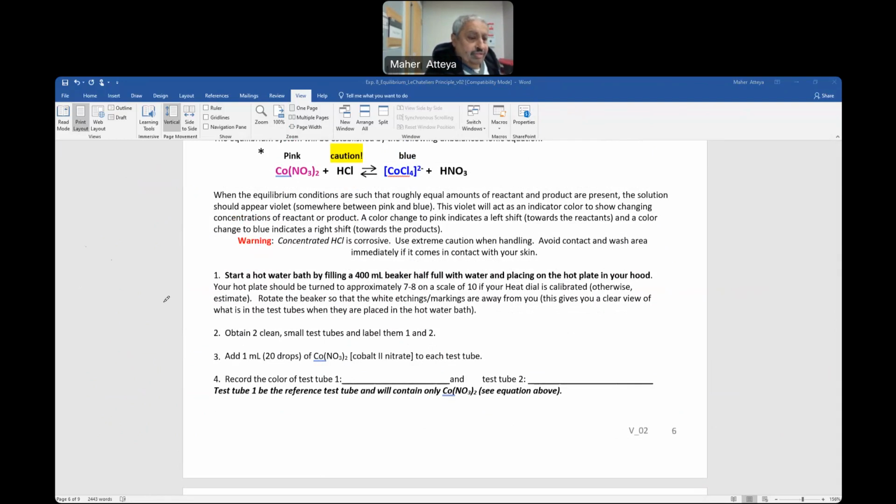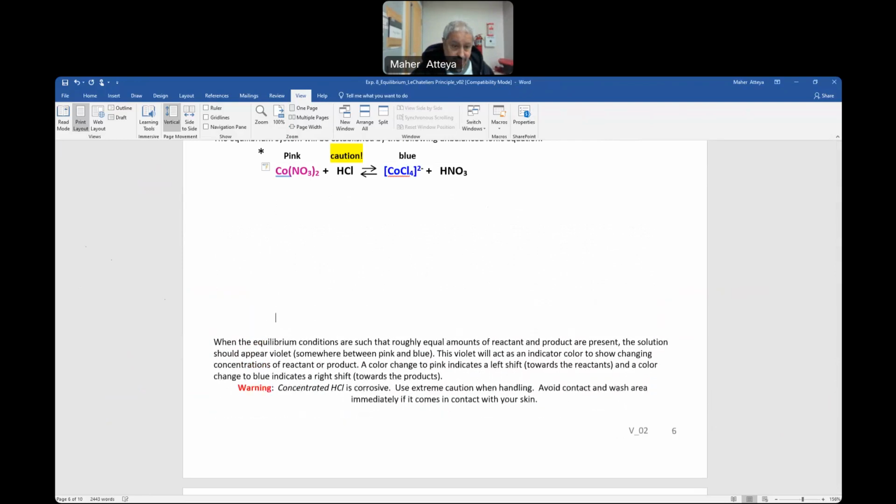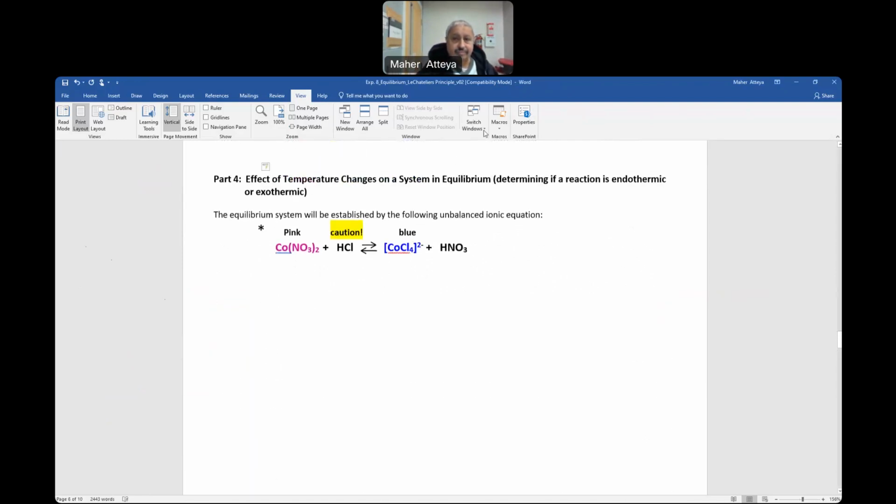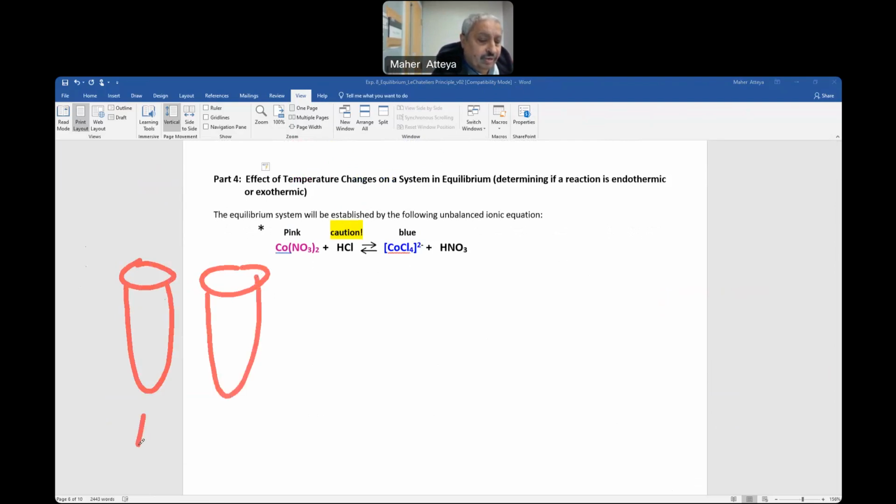So you have 2 test tubes here. Maybe let me take it. So here it is. We'll have 2 test tubes, number 1 and 2.